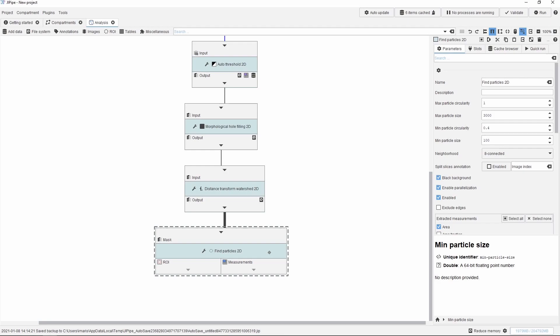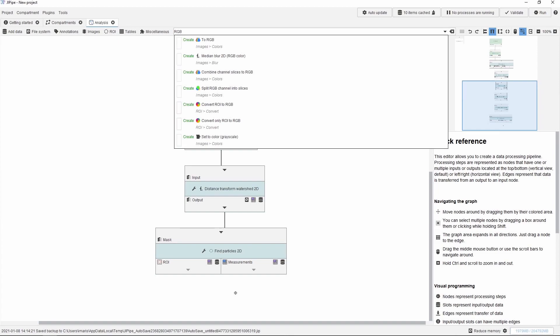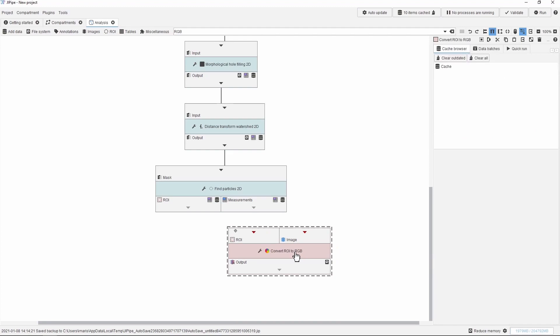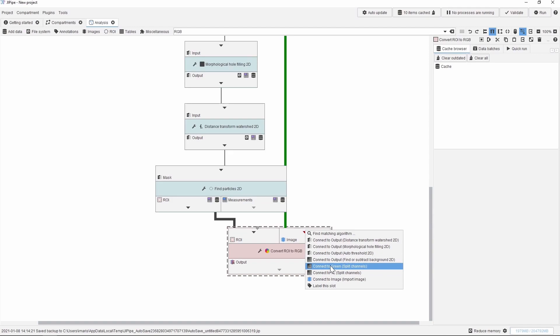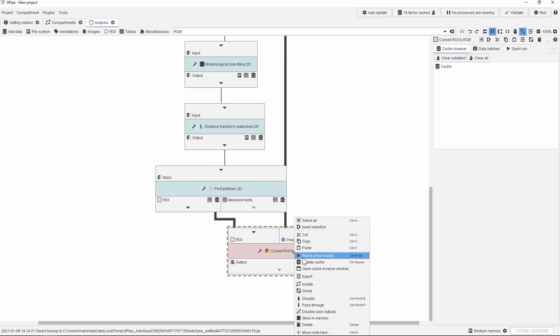Let us now generate an overlay just like we did in ImageJ. For this we have established a special node in Jipipe. First you place your cursor where you want the new node to appear and then type the search command into the bar. This node requires two inputs: one is a list of regions, that's the ROI input, and the other one is a reference image on which the overlay will appear. We make the connections between outputs and inputs using the mouse. When the line turns green the connection is established. In order to see the final outcome let's run the update cache command, and now we have the overlay between the two images.